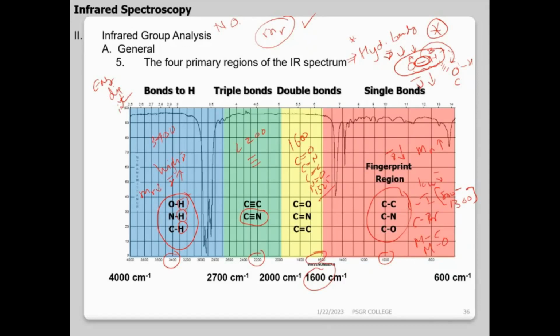If you look at a database, they keep the fingerprint region. You have the whole spectrum, but they will match the fingerprint. Suppose I discover a new compound after so much struggle and try to put it in the database. If it matches an already existing compound, what does it mean? It means the compound I found already exists. That is the level of uniqueness IR gives.